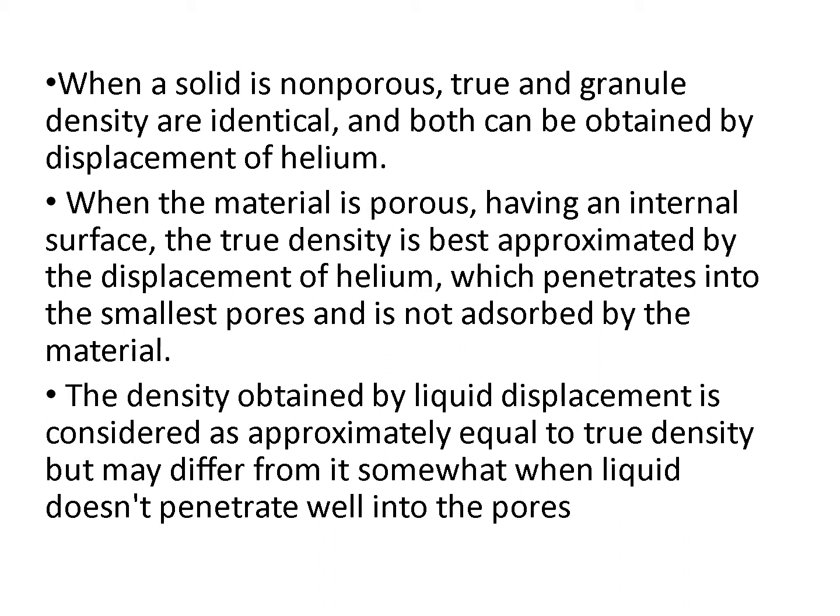So we know the number of moles, we know the temperature, and the pressure is measured, so the volume is measured. By subtracting the volume of the empty chamber minus the volume of the gas in the sample chamber, we can get the true volume.